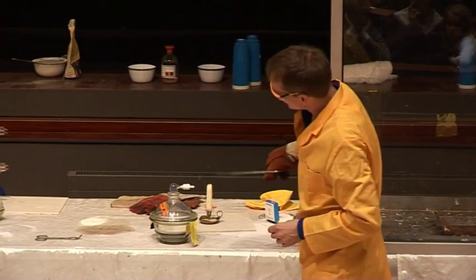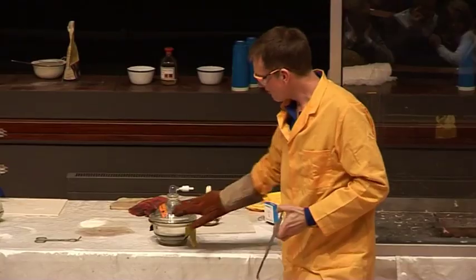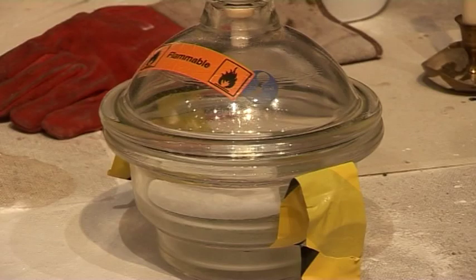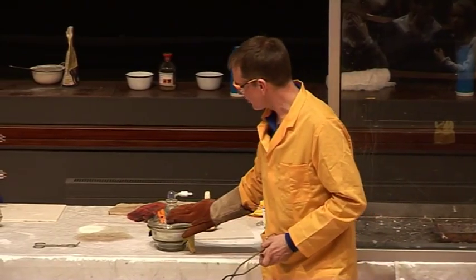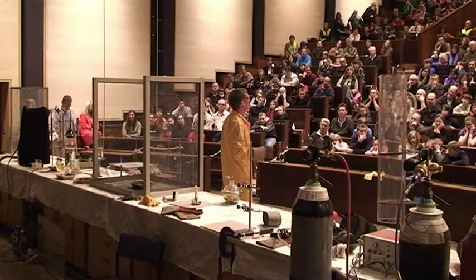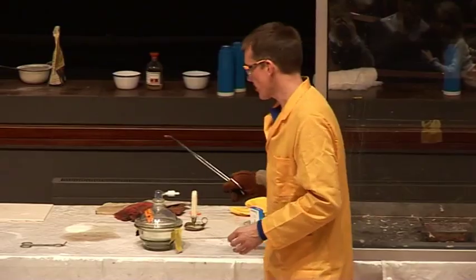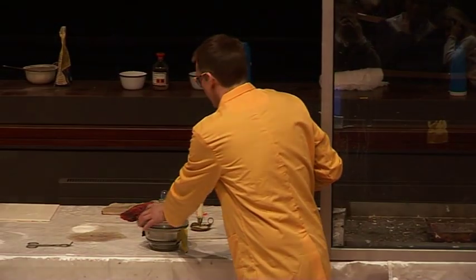Right, now at the moment, because we can't have the white phosphorus in contact with air, we've filled this container here with a different gas called argon. Argon is incredibly unreactive. It doesn't react with anything at all. Absolutely nothing. So the phosphorus is safe at the moment, but as soon as it comes into contact with the air, it should catch fire. So when I take the filter paper out and hold it up, hopefully you'll see a reaction. If we can just have the lights down just a little bit, please. Thank you.